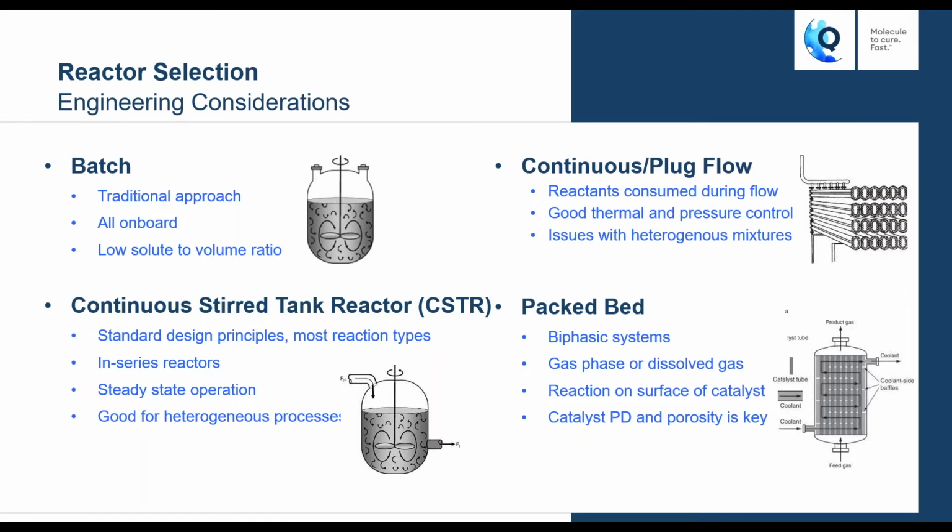less good with heterogeneous mixtures. The final type of reactor that we use at Quotient Sciences, which I won't speak about too much today, are packed bed reactors, which are typically biphasic systems where you've either got a gas or dissolved gas passed over a solid substrate like a catalyst, which allows the reaction to take place.